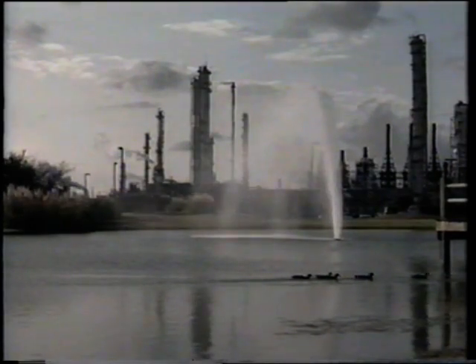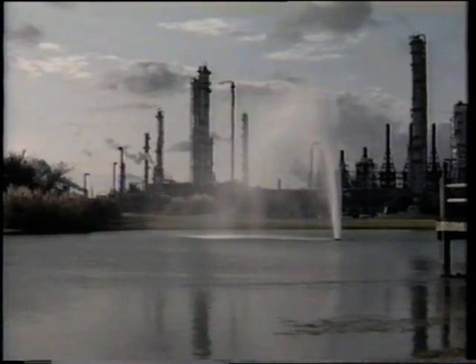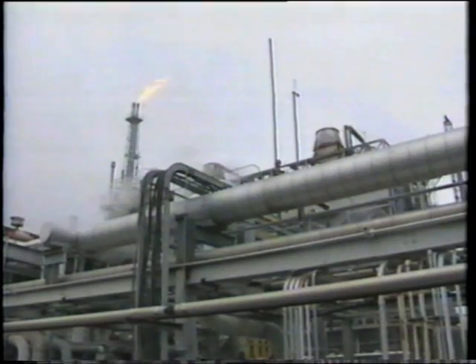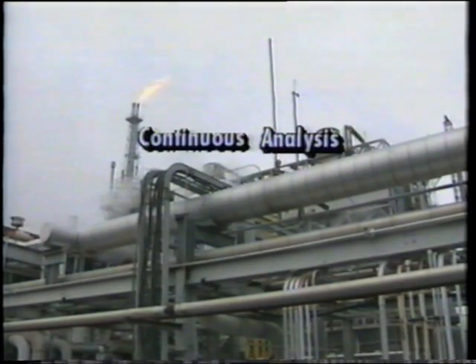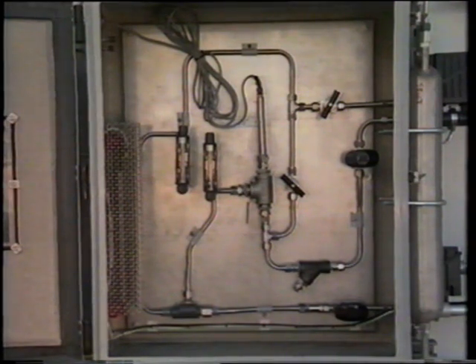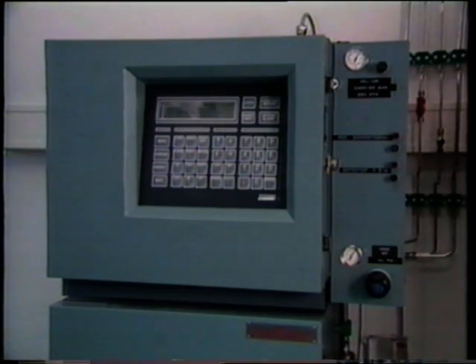Government regulations require process and emissions analysis. Analyzers are an effective means of monitoring the environment inside and outside industrial facilities. Two methods of process analysis are continuous analysis and automatic batch analysis. Continuous analyzers provide uninterrupted process monitoring. Automatic batch analysis measures process materials by taking discrete samples on a periodic basis. In the next segment, you'll learn about one type of batch analyzer, the gas chromatograph.